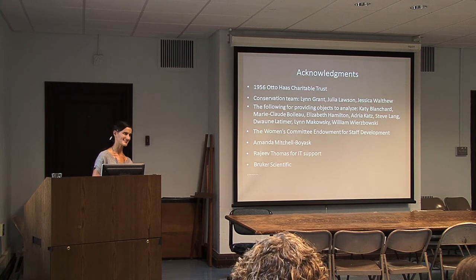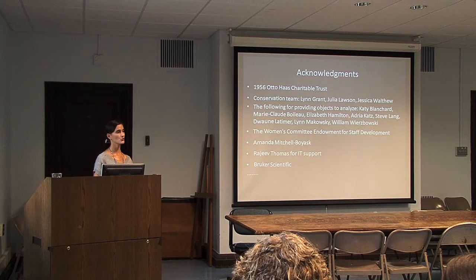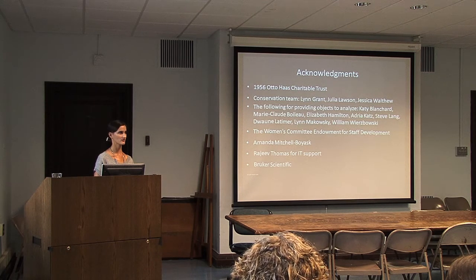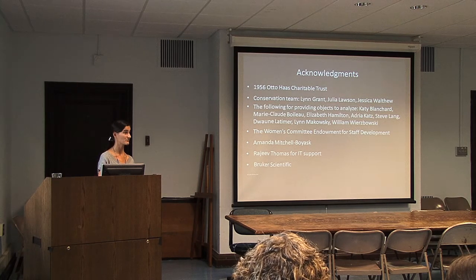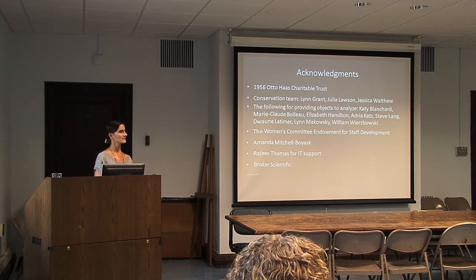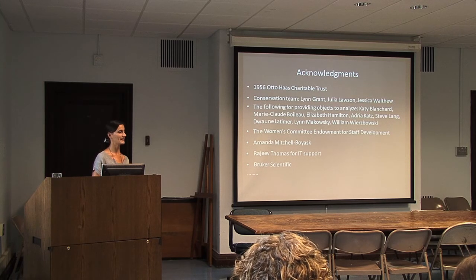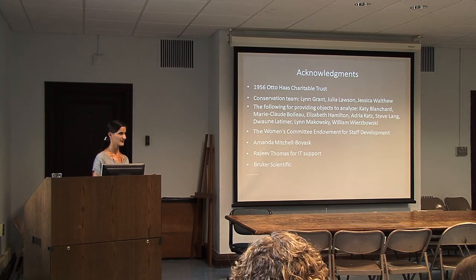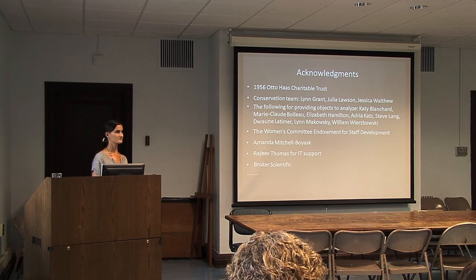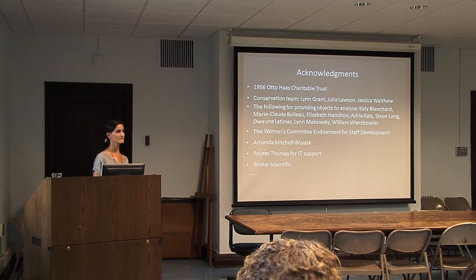Well, you can and you can't. Are you talking about obsidian or ceramics? It was in one of your slides. Yeah, it was metals analysis. It was that you couldn't use it for metals. Well, ore metal sources are so manipulated. They go through high processing that any information is lost in the production method. Which means things get mixed in together. Things get mixed and homogenized and things get burned out. Rare earth elements are very useful in sourcing, but in metals they don't survive the processing. So they're not there for us to look at. And metal ore bodies are so heterogeneous that from one place in the ore, in the mine, to the other, you get very different results. Right. Okay. Thank you, Elizabeth.